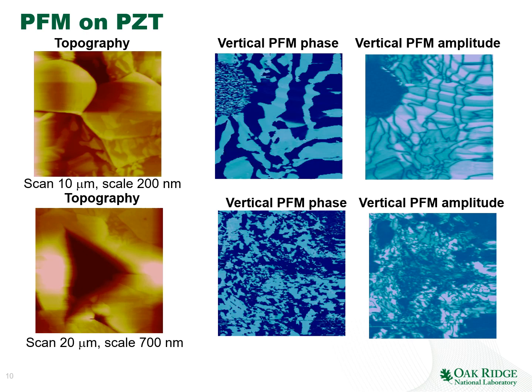You can also see that the indentation actually strongly affects the domain processes. So in this particular experiment, we saw how nanoindentation changes the domain configuration inside the material.